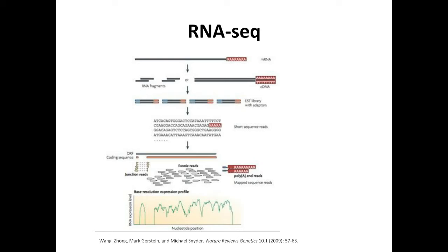After sequencing all these samples, you need to map them back to the reference genome. For most species of interest, a reference genome is available. So we can map these sequence reads to the reference genome, and based on the number of reads that map to each gene, you can quantify how much of that gene is expressed. This is a typical RNA-seq experiment, used by us and most labs studying RNA sequencing.